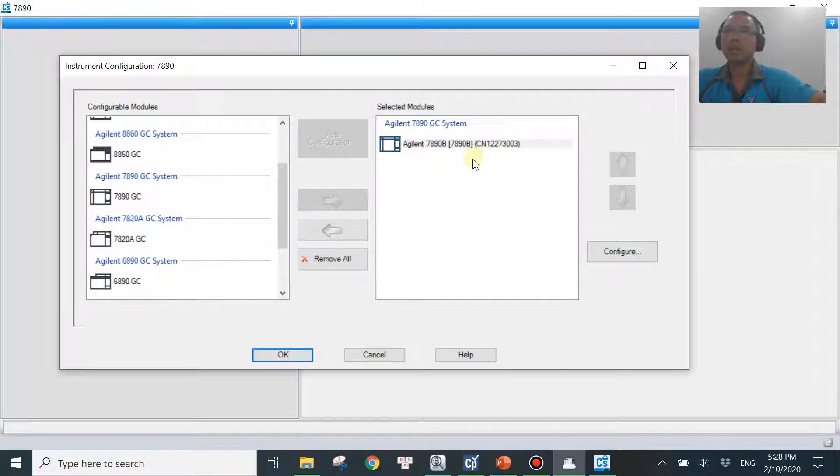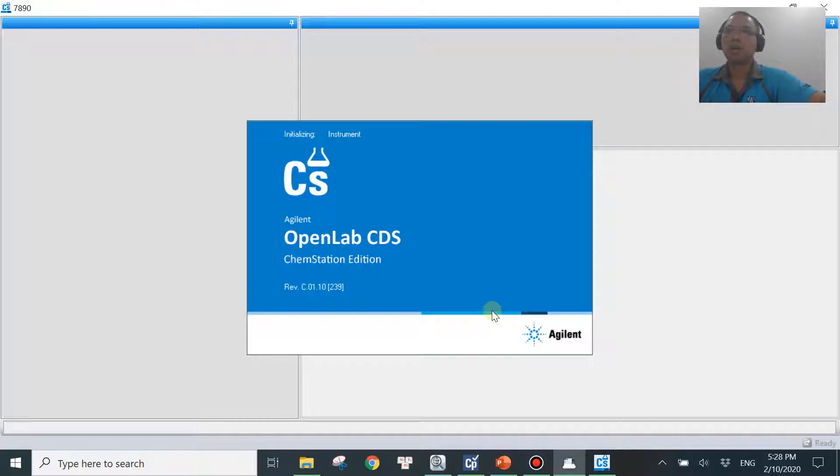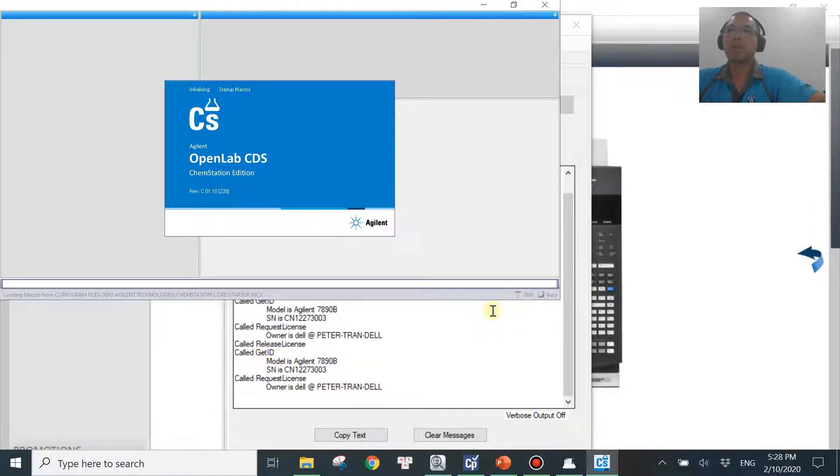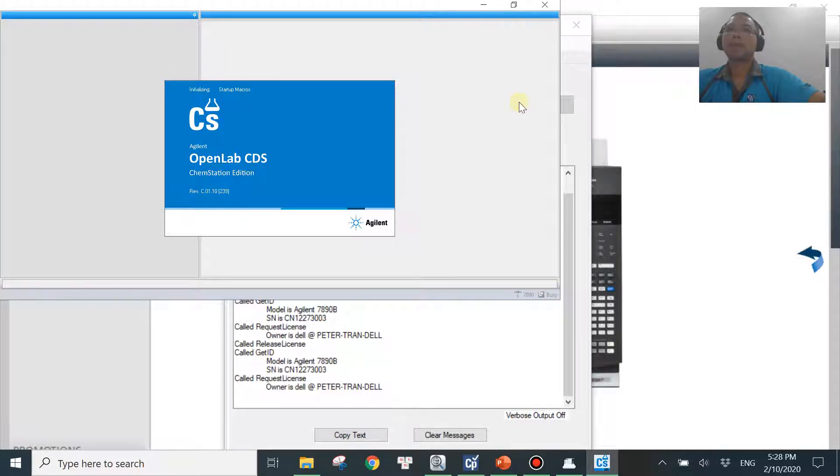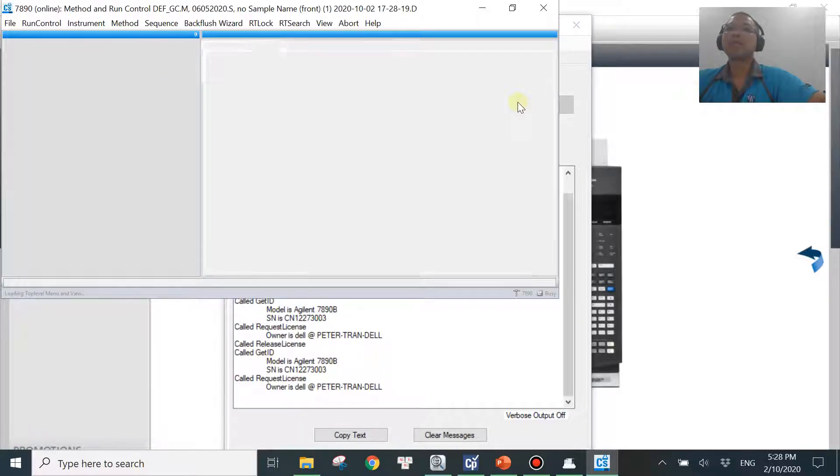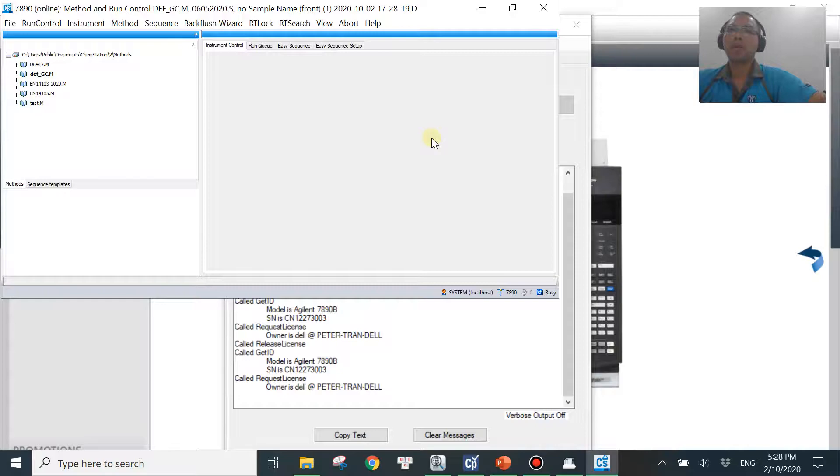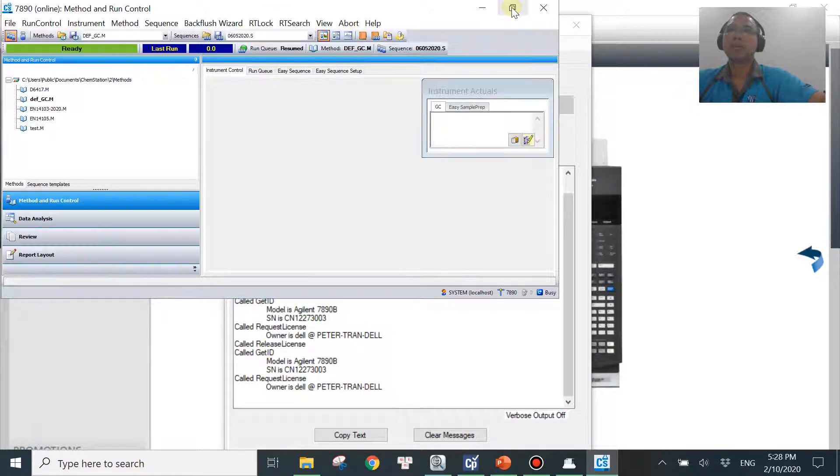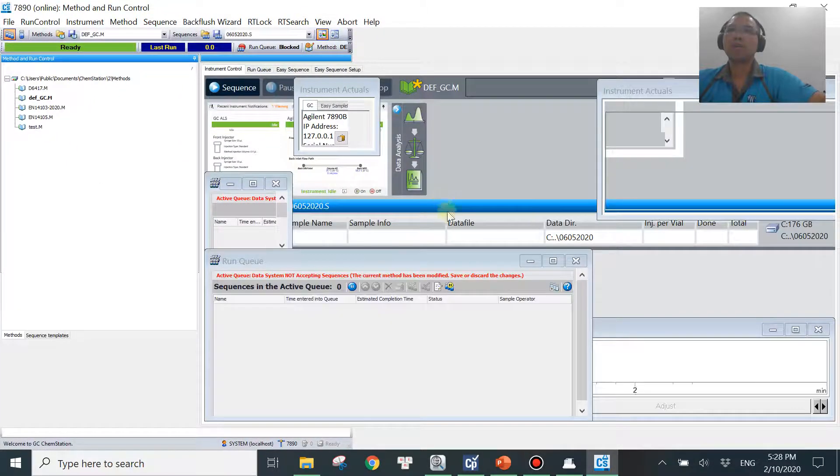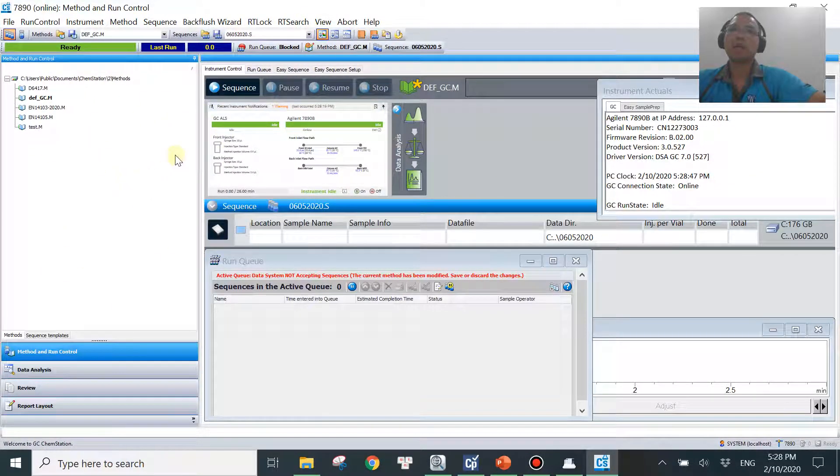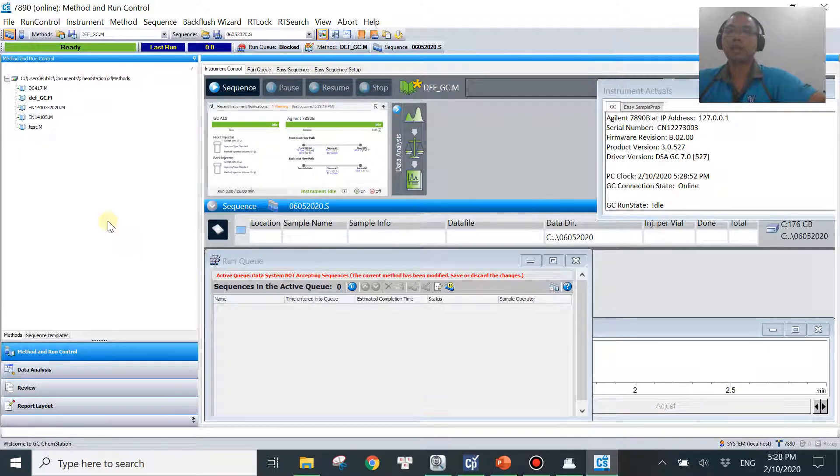And then the GC is configured successfully. Just hit okay. And then the software will be able to generate and to launch successfully. And then you can just start running your data to acquire your data, change your method, whatever, as normal. No more error message. Let me maximize the window. There you go. ChemStation, no more error message. And the GC is able to be connected successfully without any more errors like that.